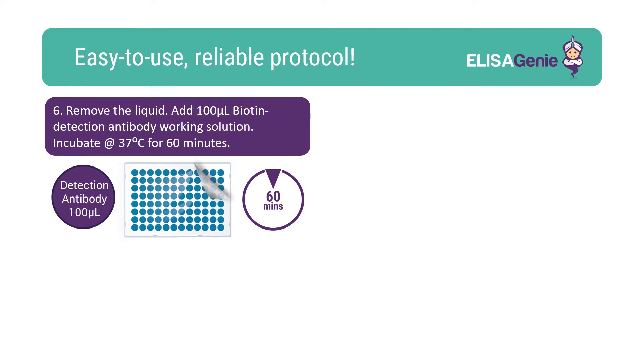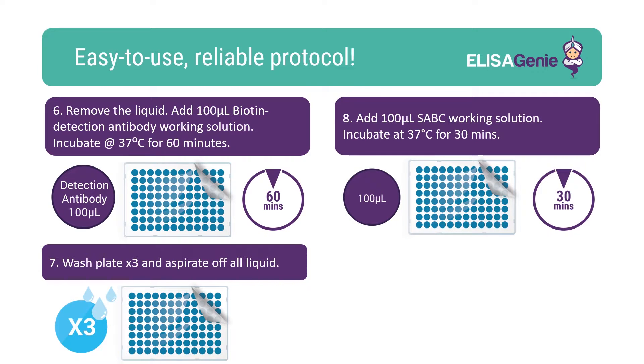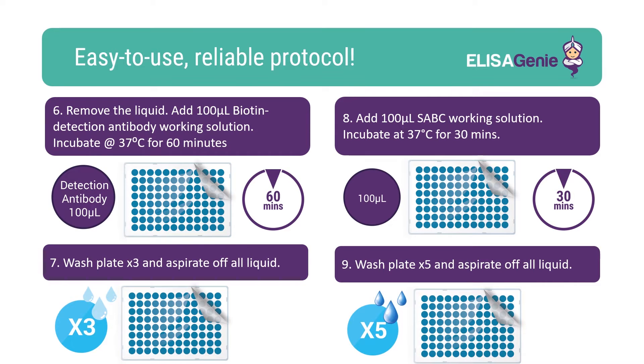Once plates are washed, add the biotin detection working solution, followed by an incubation. Again, wash the plate, followed by the addition of SABC working solution and incubate. Again, another round of washing the plate.